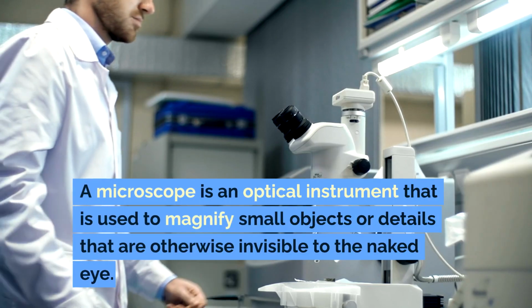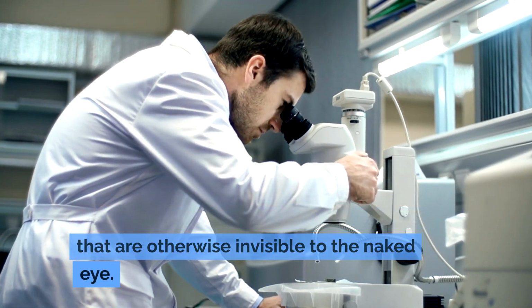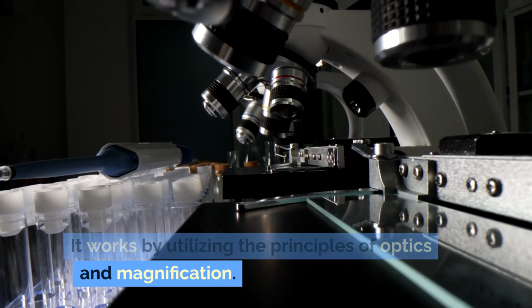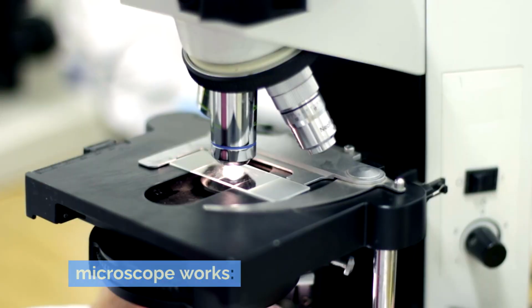A microscope is an optical instrument that is used to magnify small objects or details that are otherwise invisible to the naked eye. It works by utilizing the principles of optics and magnification. Here's a basic explanation of how a microscope works.